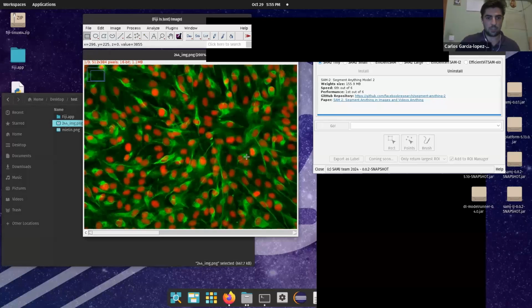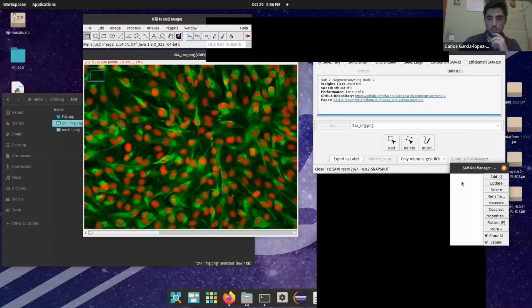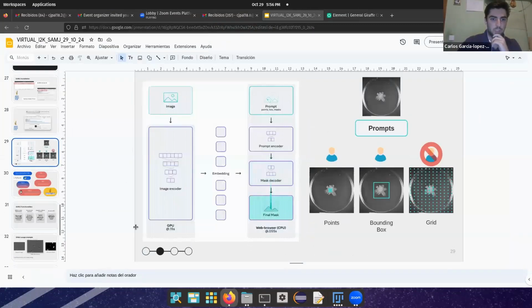We can see that this is the image of the example. It's a little bit challenging to segment everything, but we just select the model here, select the image 10, then click on Go. Remember, Go is doing the part on the left, which is quite heavy, let's say, but with these tiny models it can be done quite fast. It's not immediate, but it's quite fast, at least on my computer.